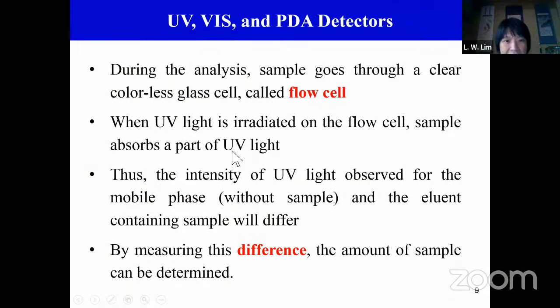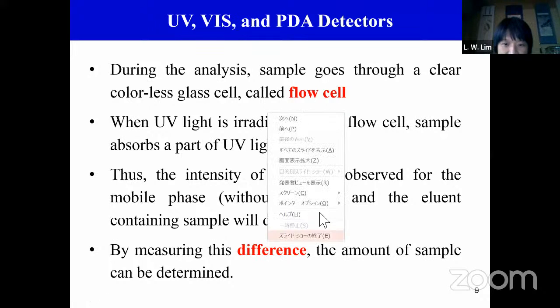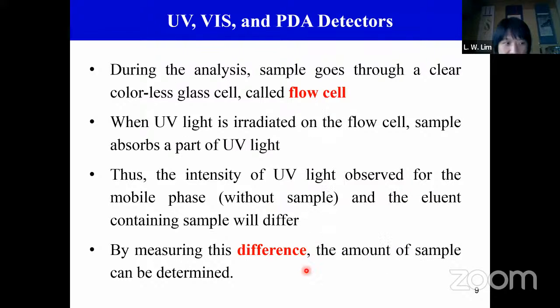So we usually use direct detection and we measure the difference between the eluent and the sample.